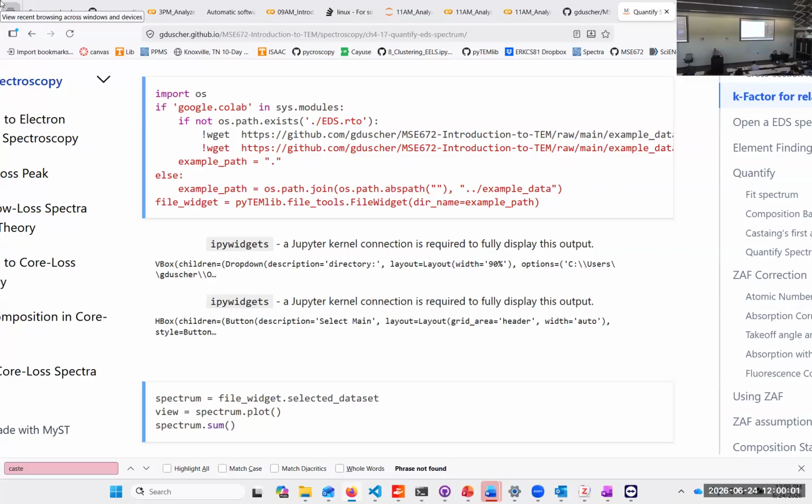The mean free path in EELS, so you can measure the thickness. The mean free path in EELS is usually, we will discuss that, not very accurate. I would suggest convergent beam patterns in two-beam condition. So thickness fringes there can be directly correlated with the crystalline part of that. So if you have a good sample, that gives you an excellent one. Or you can do, say, absolute thickness with the ionization edges. That works also very well, and we'll see how that works at 3 p.m. when we do the yields.